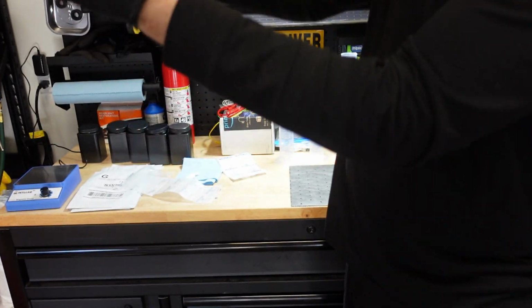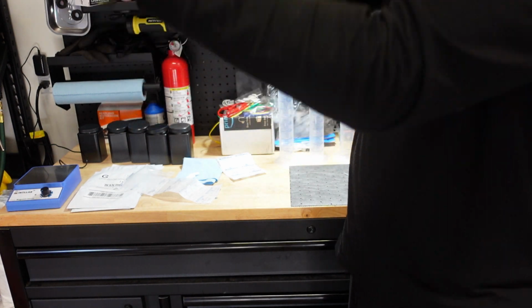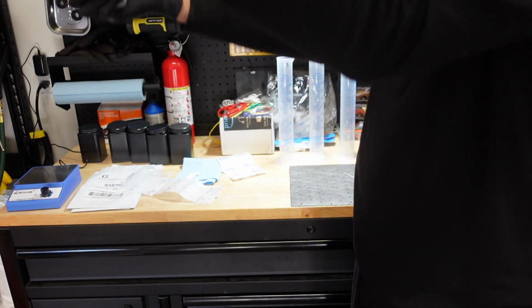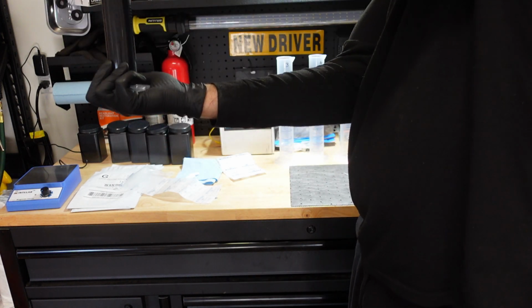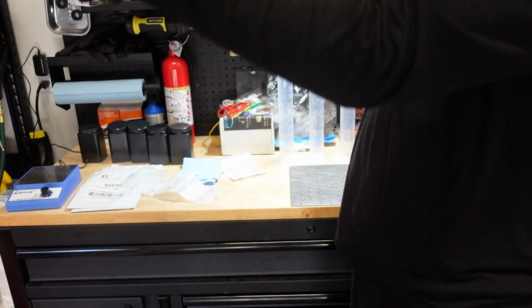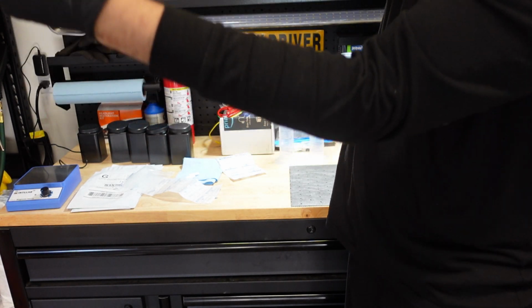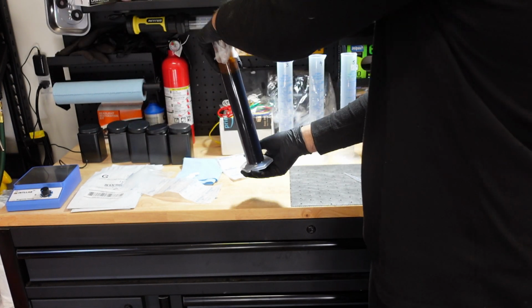How many times is that? I think that I'll just count 4. I count this as 5 because I can't keep up. 6, 7, 8, 9. I'll do 3 more, just to make sure. Okay, that should be thoroughly mixed, inverted up and down.